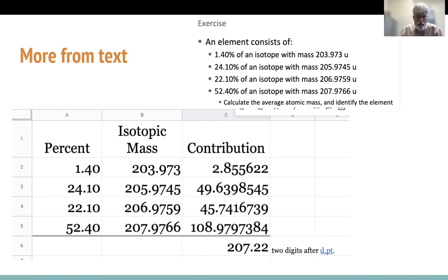To be very brief on that, I have 3 sig figs here, 3 sig figs. I chop off right here, so I have 2 digits after the decimal point. Here I have 4, so 1, 2, 3, 4. Oh, good, to 2 digits after the decimal point as well. Here I have 4 sig figs. Here I have many more than 4 sig figs. 4 sig figs. 4, many more, 4.